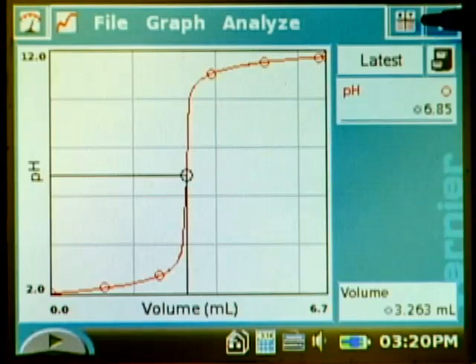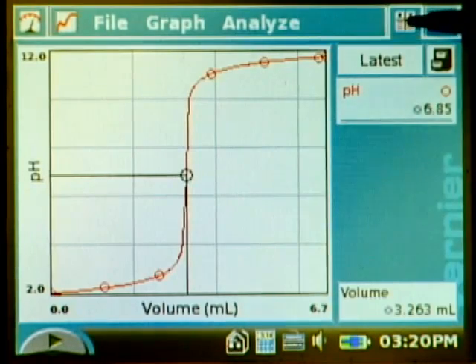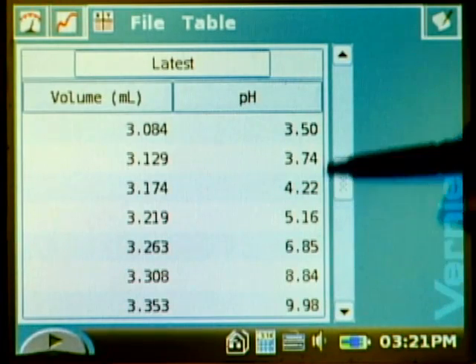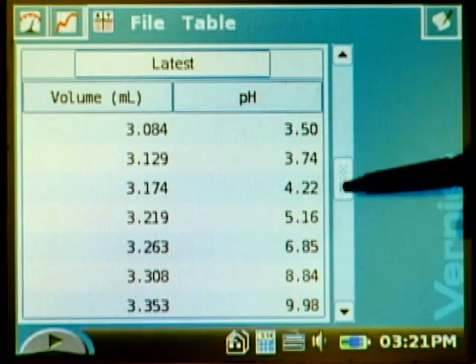If we go to the table tab we could scroll through and look at the changes in pH and find the largest jump. That would be one way but there's a few other ways that are even better.